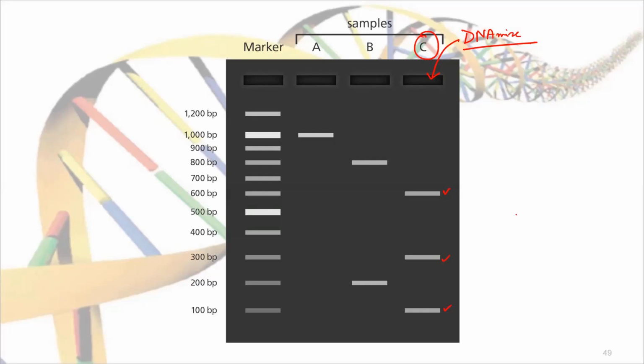So one thing you have understood, that the 3 fragments formed by cutting the DNA molecule are separated from each other. Now the big question is, how will you identify which fragment is the fragment of your interest, or which of these bands contains your gene of interest? Because you can only see their separation. We know that they got separated based upon their molecular size or fragment size. Now the point is, which of the bands contains your gene of interest? Because you cannot see any nucleotide sequence here. It is only that the DNA fragments are separated and they are settled at different positions in the gel.